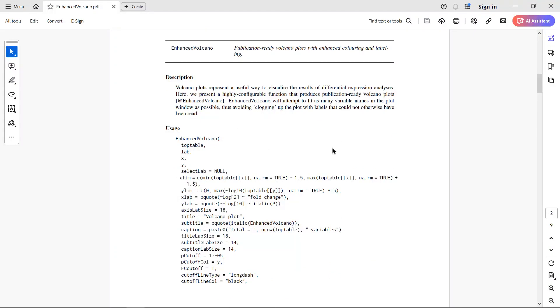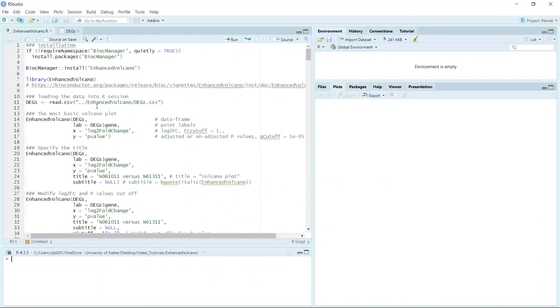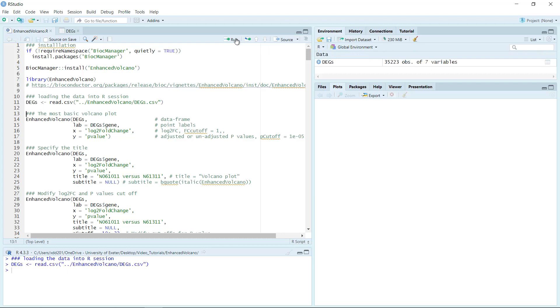Let's generate a volcano plot first, then we can explain how to adjust some of the arguments. I'm not going to show you all of them today. So we can go to R. First, we can load the dataset. I generated the deg.csv data according to the online package. We can just load the data into R using the read.csv function.